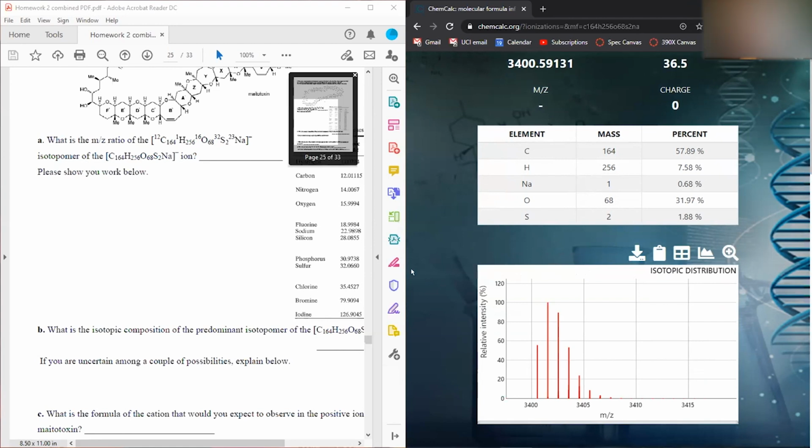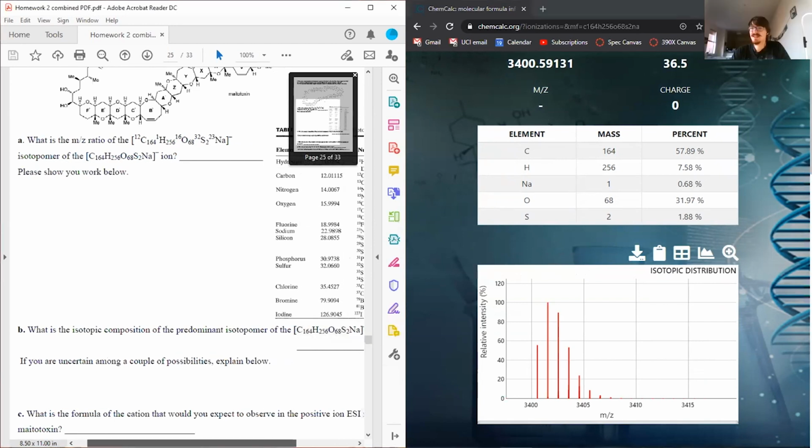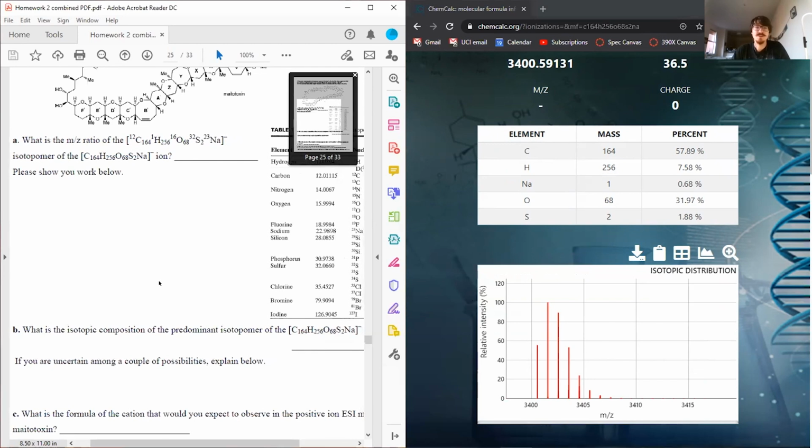Yes. And then you said that an extra C13 was the most likely way to arrive at that? Yes. I would agree with you. So I think that hydrogen, oxygen, sulfur, sodium does not, but everything other than sodium, in theory, you could end up with an M+1.